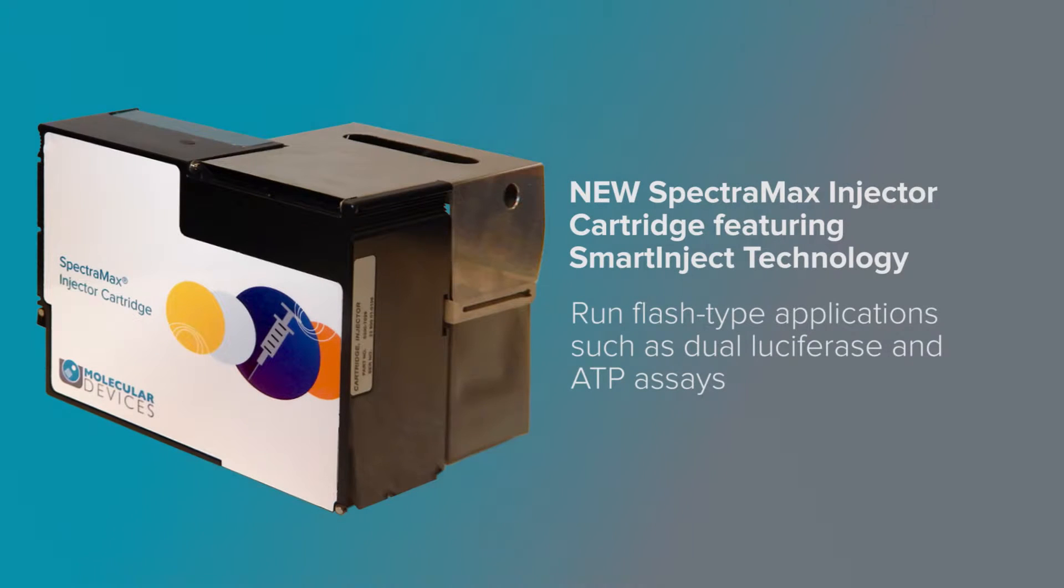Including flash type applications such as DLR and ATP assays with the new SpectraMax injector cartridge featuring smart inject technology.